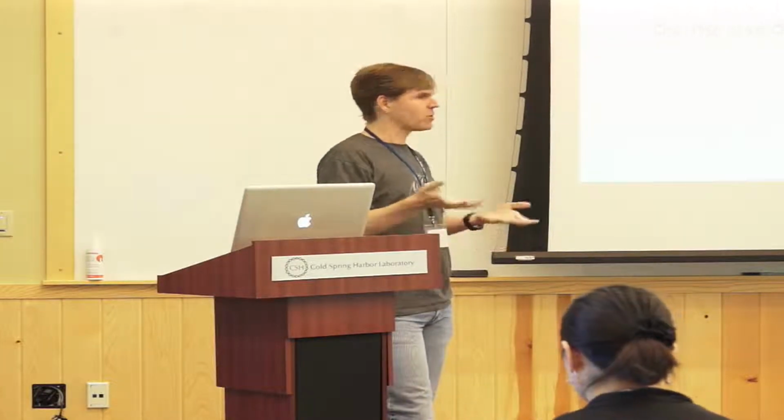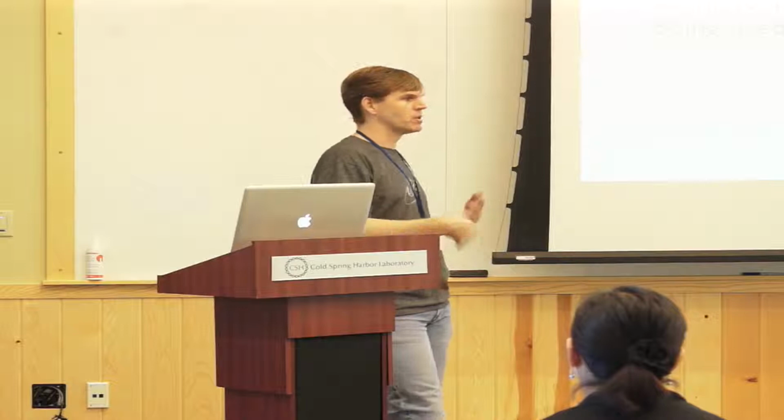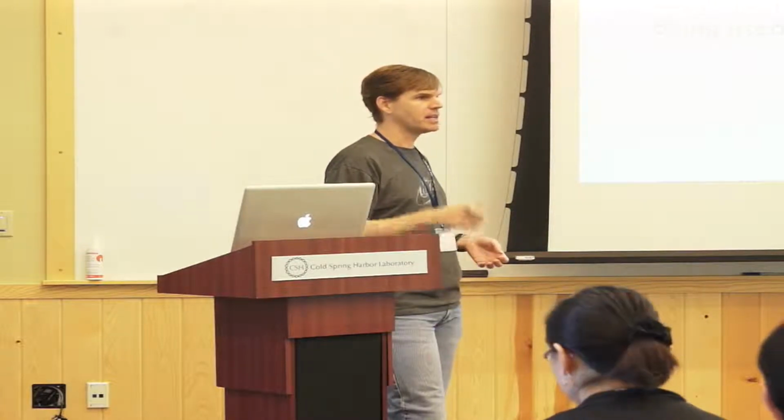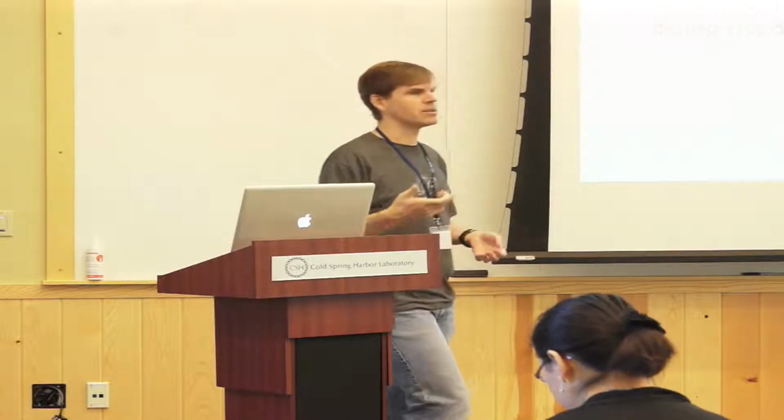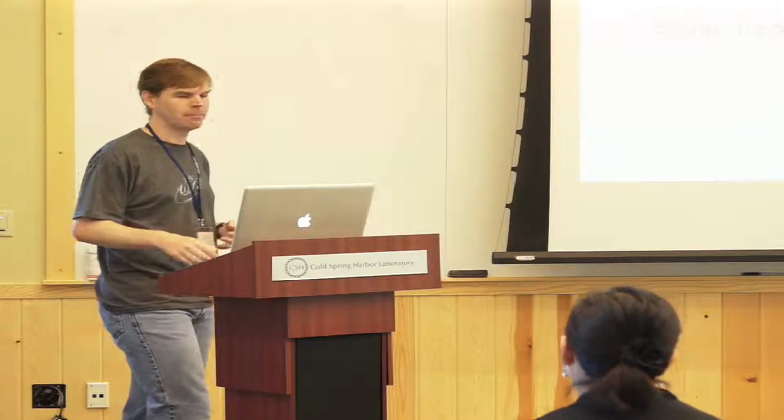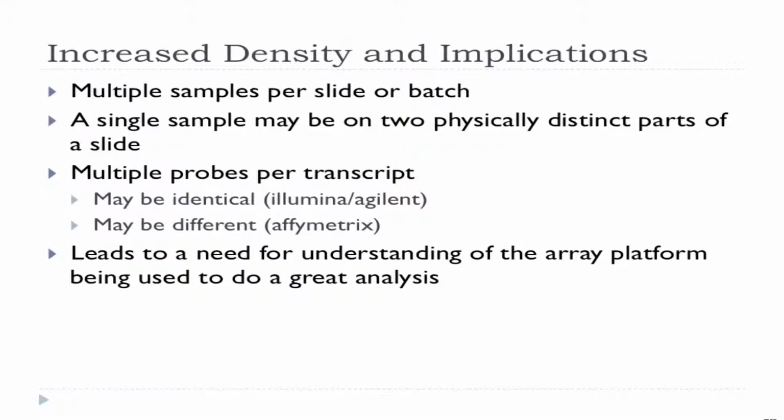And then of course Illumina software needs to be used to translate each of these slides, because they're all unique, into the data that we end up using. Does that make sense to everybody? Okay. That's a good question.